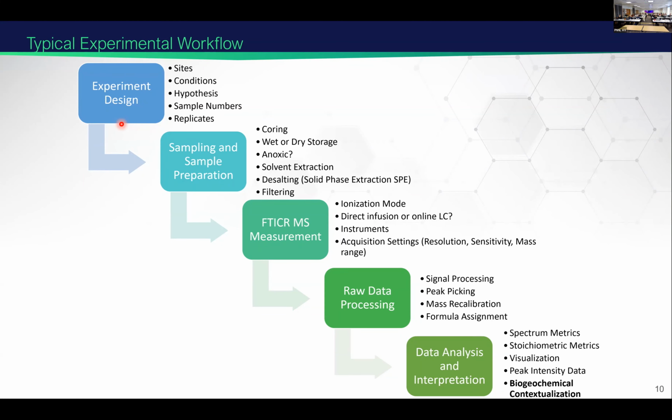The first thing is, of course, designing the experiment. Then you've got your sampling stages, sample preparation. Then we do our mass measurements. Then we have data processing, and then we have data analysis and interpretation. These last 2 sections are the focus of the tutorial this afternoon. But for the sake of completion, I'm going to go through each of these in turn.